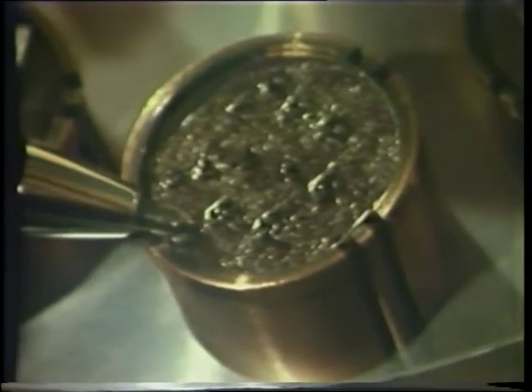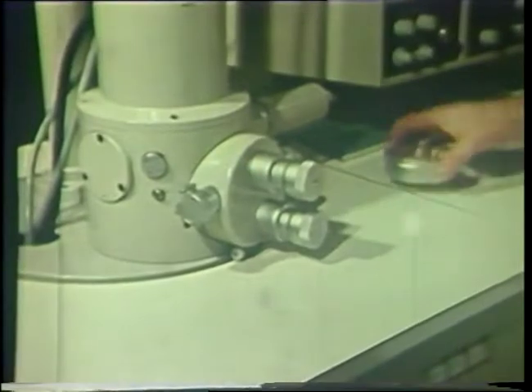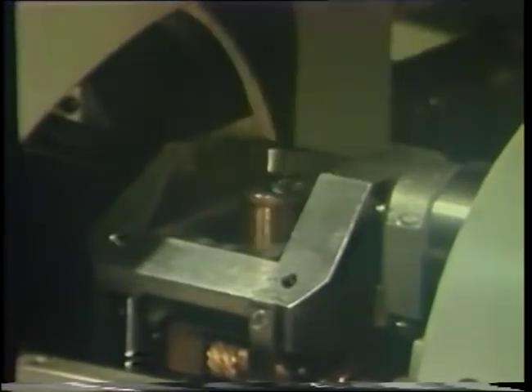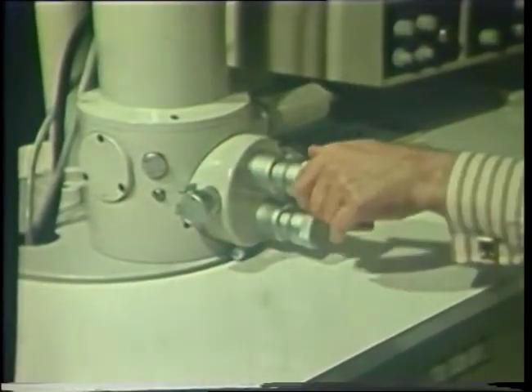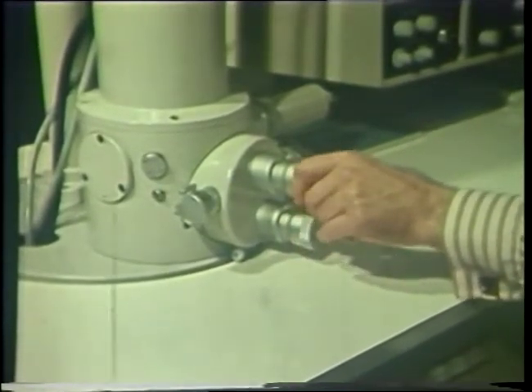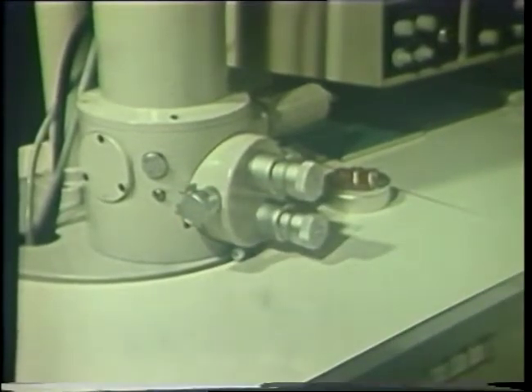Here you see a number of fleas mounted on a stub ready for study. The stub is then placed in the specimen chamber, the chamber closed, and the column pumped down. Four control knobs outside the specimen chamber control the orientation of the stub on X and Y axes, rotation 360 degrees, and inclination from minus 5 to plus 45 degrees.